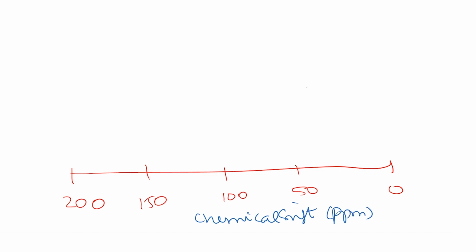And so, what we normally see is that this region between 0 and 50 is for saturated carbon. So, R CH3, R CH2, CH3. So, these types of carbons show up between 0 and 50.